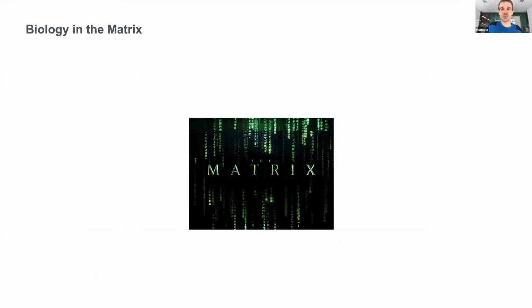And as a computational researcher, we're really excited about getting new types of data. And I guess we think a lot about how to handle the data matrix that you get out of your genomics experiment. Over the past few years, we've been really excited about single cell technology and have developed lots of open source software tools for this type of data.